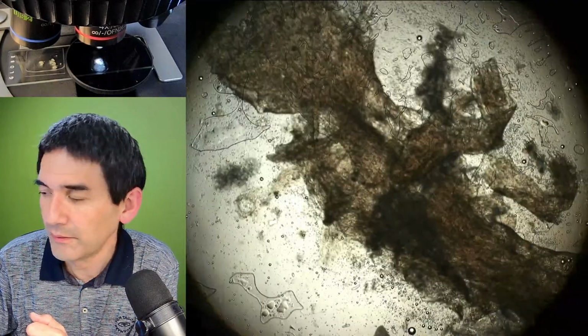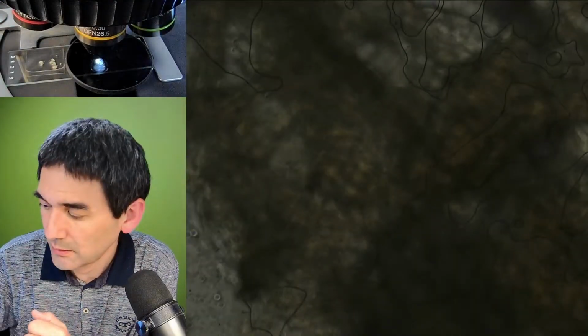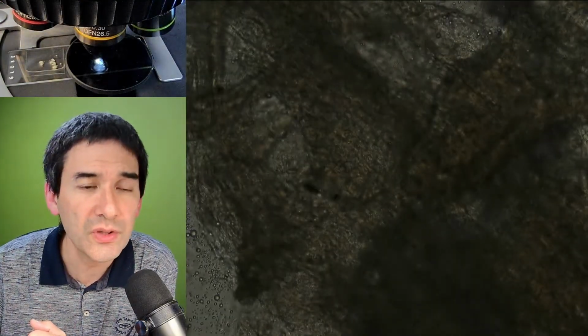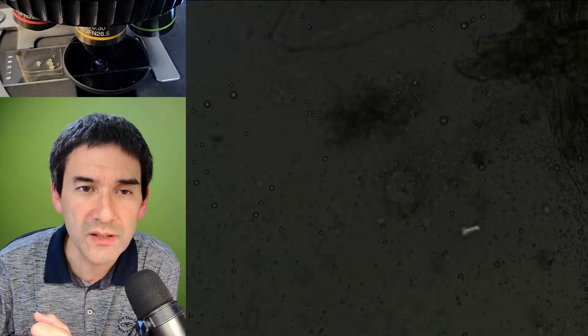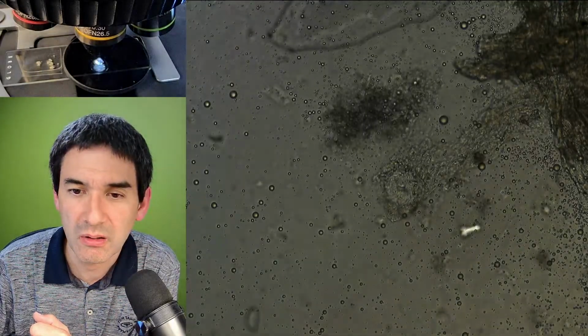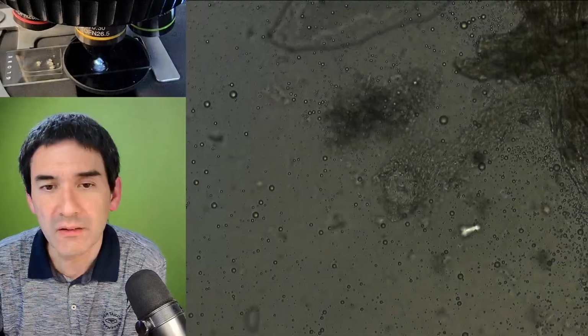Let's put this one here. Brighter. Refocus. Yeah, it looks kind of weird. This is basically DIC and polarized light. Yeah, indeed, it seems to destroy the effect.